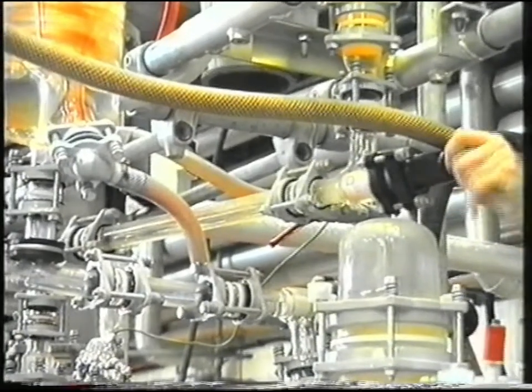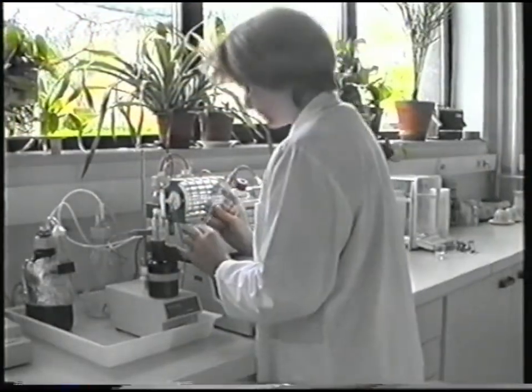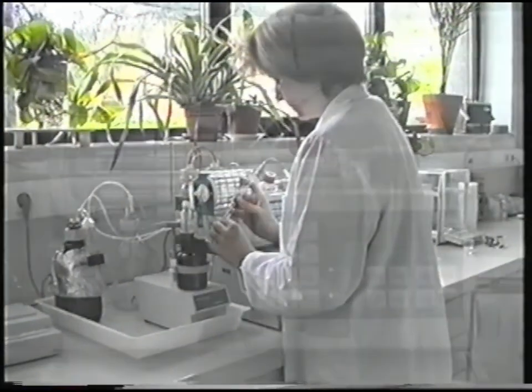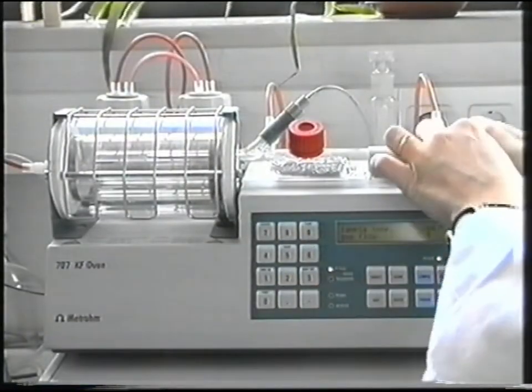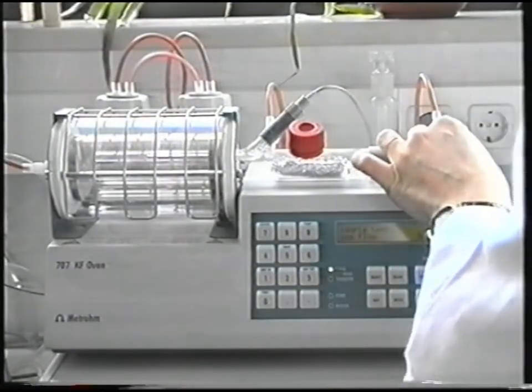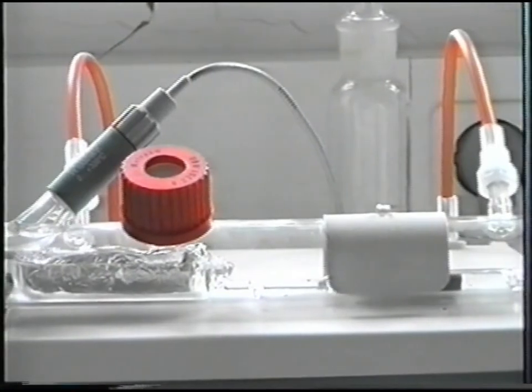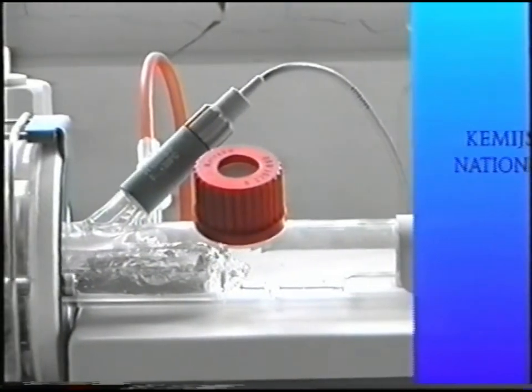Critical process steps including multiphase reactions at elevated temperatures and pressures, and difficult multi-component separations are most often studied and developed in this laboratory.